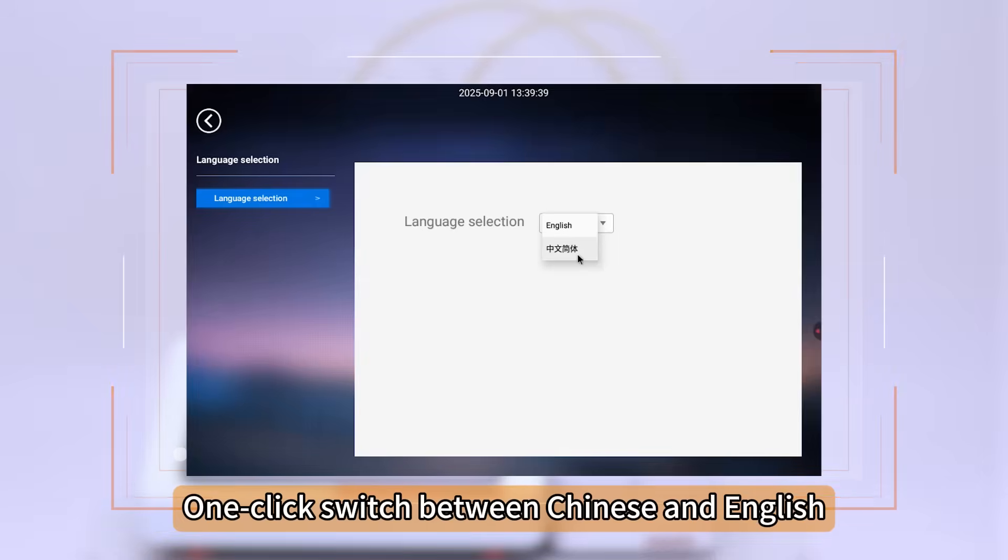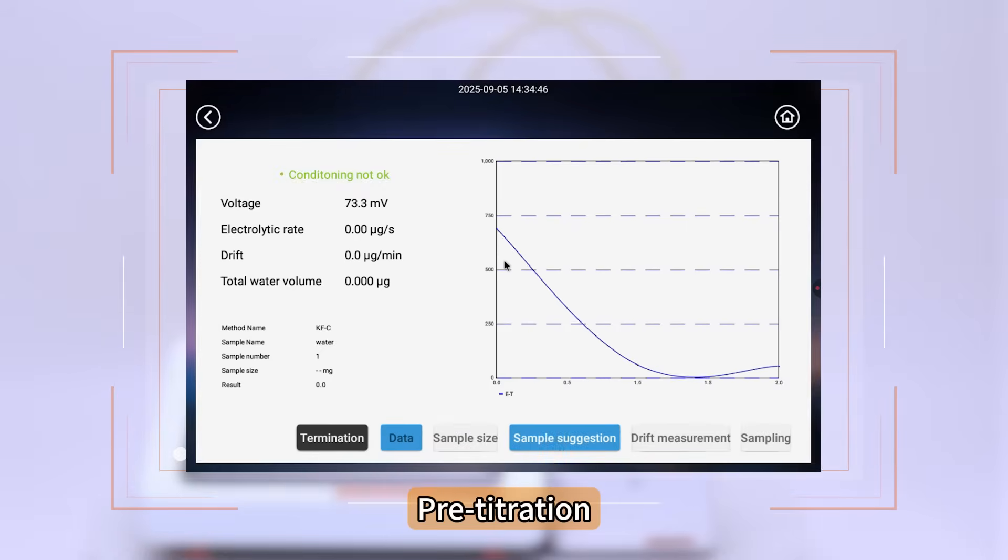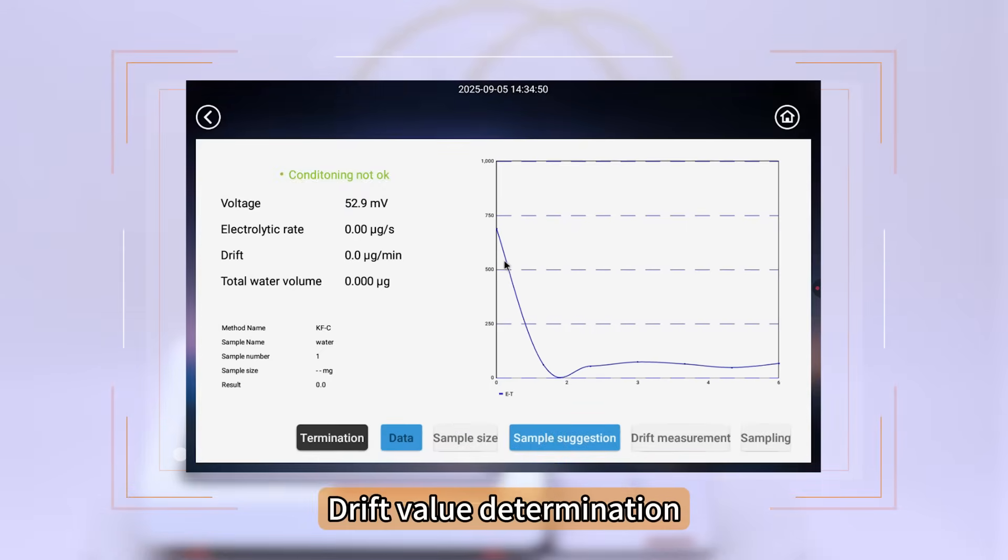One-click switch between Chinese and English. Pre-Titration and Drift Value Determination.